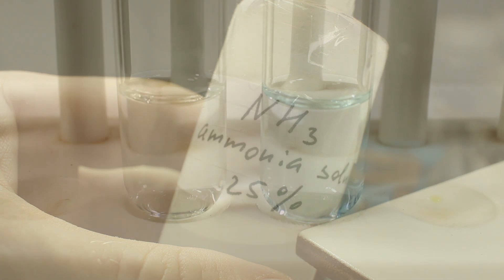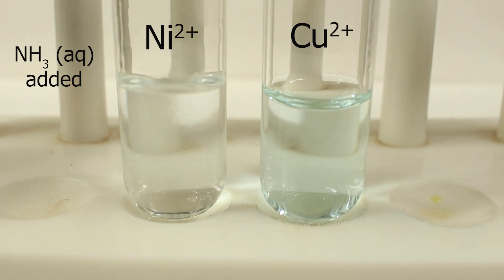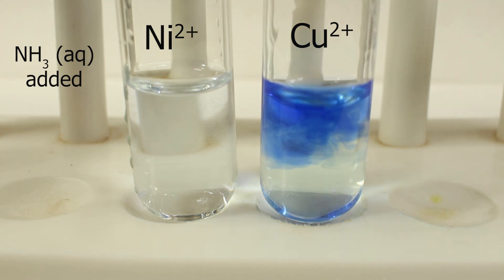Ammonia water solution to nickel. Concentration is low so nothing is clearly seen, but it actually turns a little bit violet. In case of copper II it's much clearer, deep blue solution of complex of copper II and ammonia.